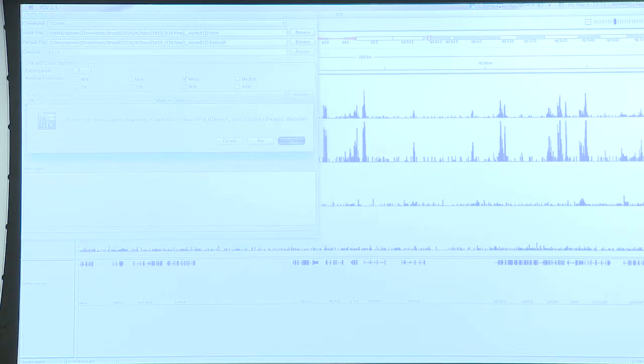It's going to ask me if it's overwrite. I just say yes, it doesn't matter. For you, I hope you don't need to overwrite that. You just do it once for each of the files. And then we should have 3 files, H3K27me3, H3K4me3, and the control. Once you've got to that point, I want to show you how to color them differently, how to make them the same size, and how to view them in a comfortable way in IGV.